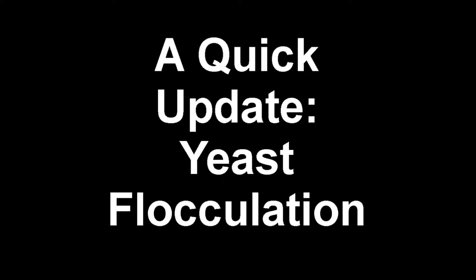Hello and welcome to this quick video that shows an example of reviving a yeast strain that has undergone flocculation. This builds on a previous video which described yeast flocculation in greater detail.